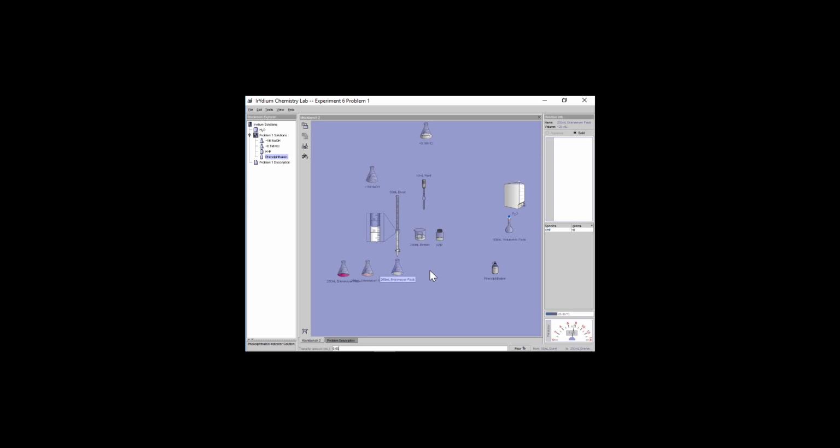So as I just dropped that in here, we're starting to see a hint of pink here. If you're not sure, add an extra drop here. There we go. We've hit this pink color. We definitely haven't overshot. This is a good reading. So I'm going to take down this reading, and I'm getting here 32.62 plus or minus 0.05.